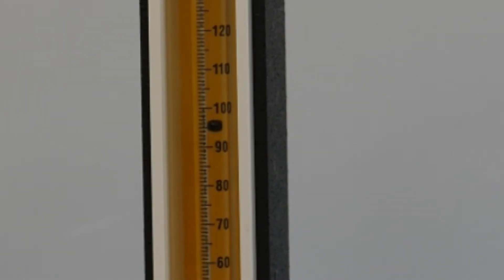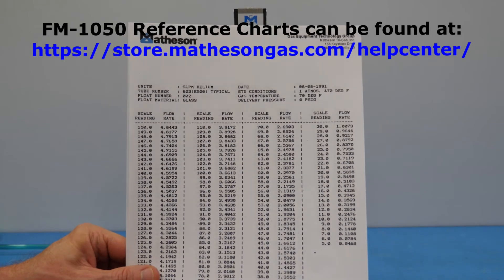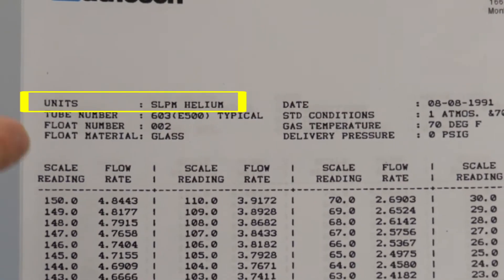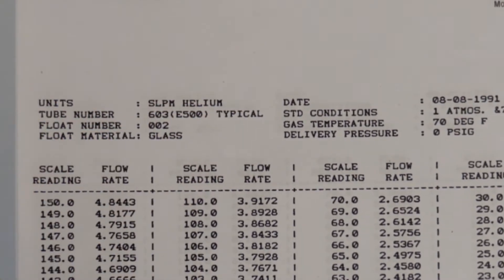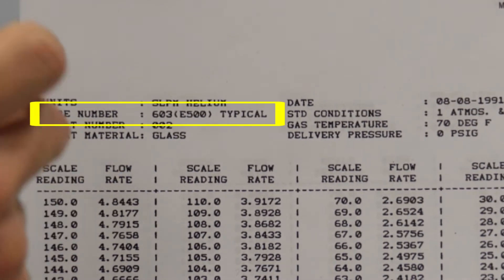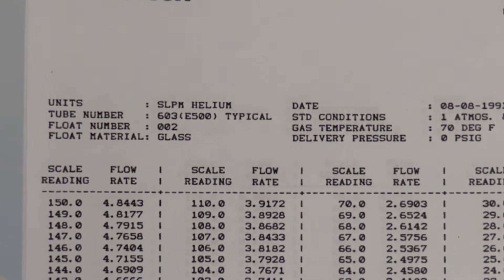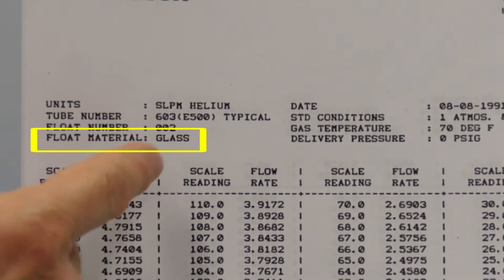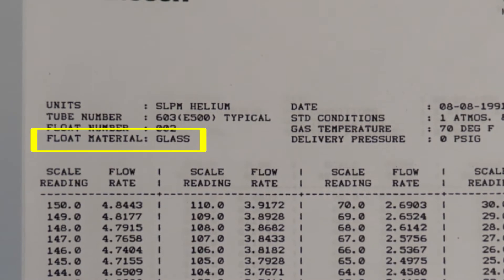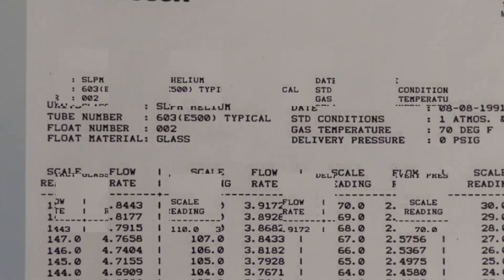Let's rotate it back. We'll take a look at our flow curve for the glass float. It's important to note that you have the proper flow curve. We want standard liters per minute helium for units. The tube number should match what's in the device: 603 E500. We want to read the glass float. Additionally, the delivery pressure is very important. In this case we want zero psi G.